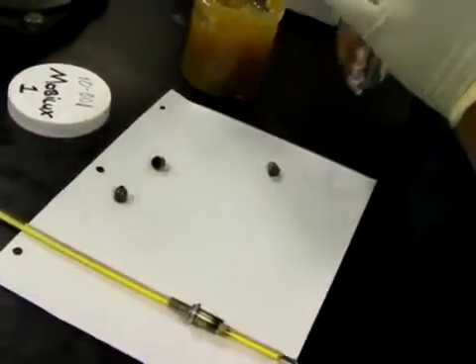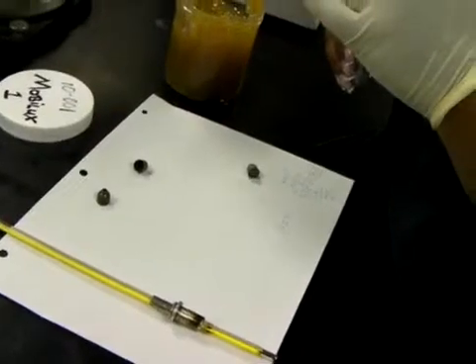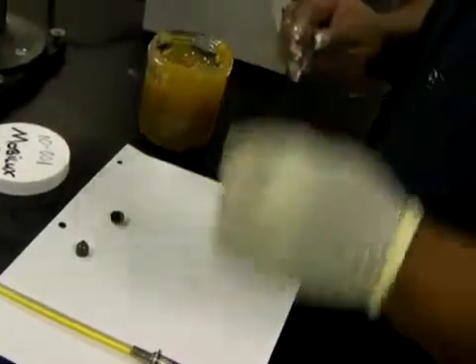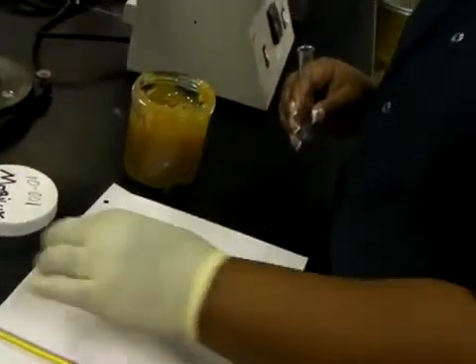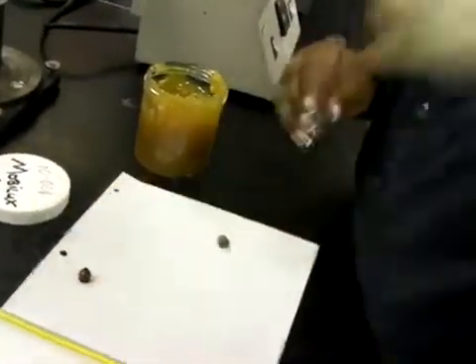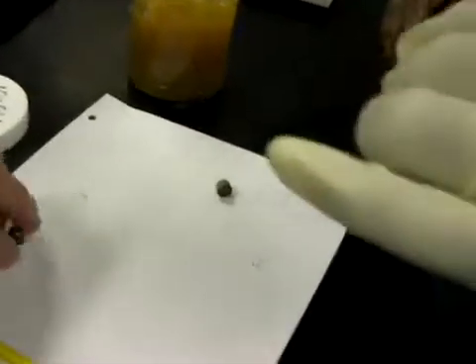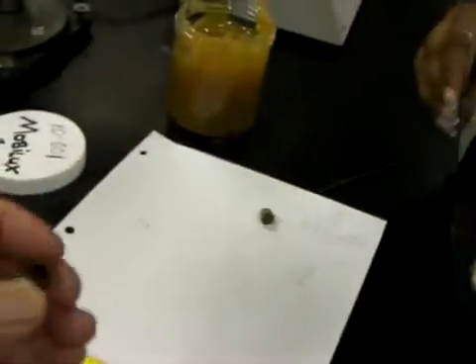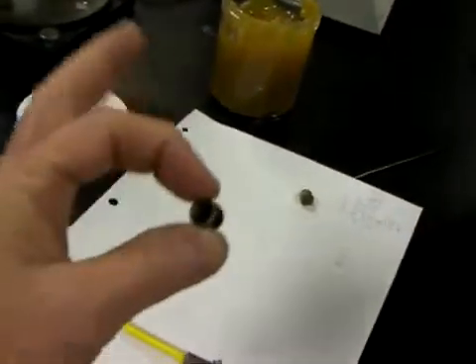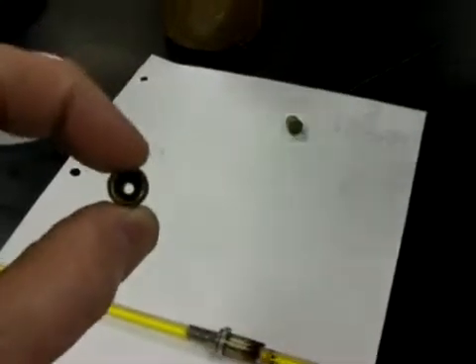We're going to test the dropping point on this grease. Kendra's going to do the work. I already have the grease in. She's already taken the grease and stuffed it into one of these little cups. There we go.